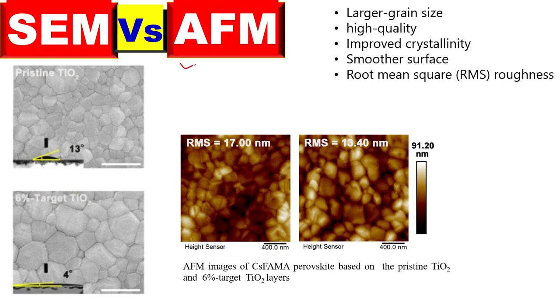In atomic force microscopy analysis, root mean square value is the key parameter to describe AFM images. Smaller RMS value means that the surface is smooth and compact, while larger RMS value means that the surface is more rough. This RMS value basically shows the variation in altitude.